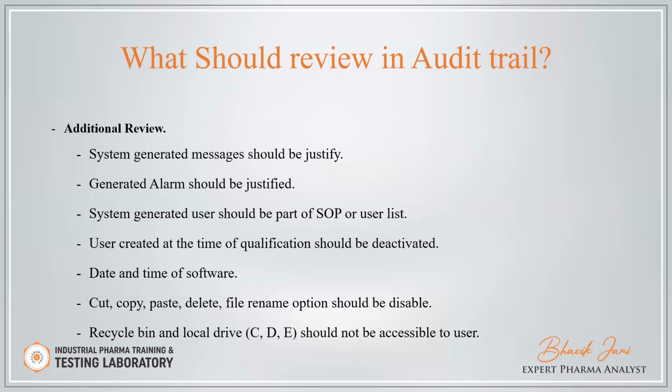System generated users should be a part of the SOP. System generated users means some default users like admin or system or scheduler. So all the users should be a part of the SOP. And who is responsible for those users is also part of the user list and your SOP.